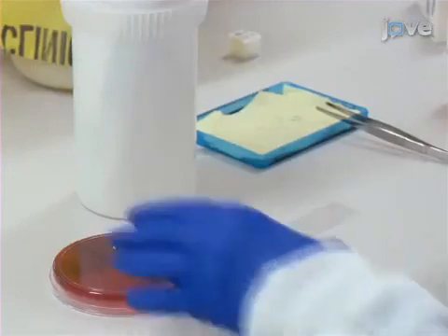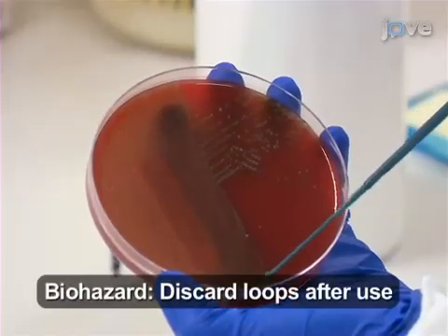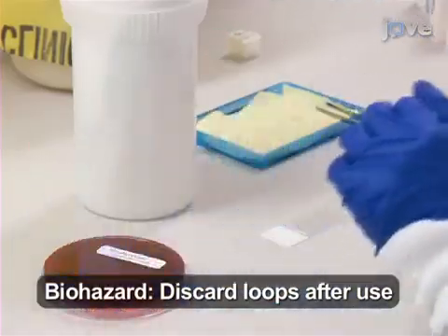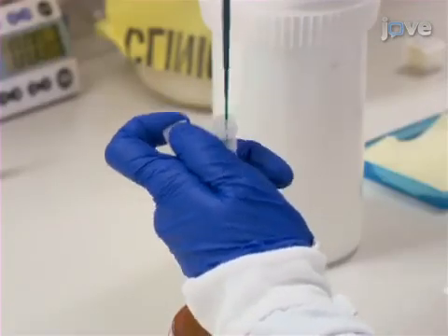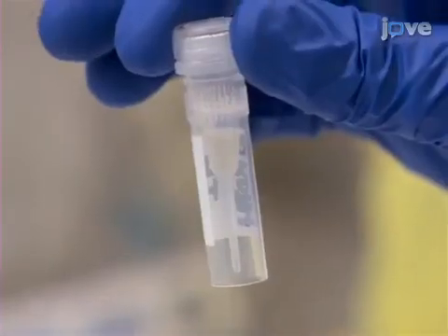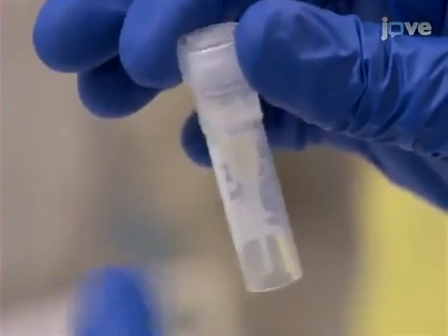Begin by using a sterile, disposable 1 µL loop to obtain a small sweep of a fresh, overnight pure culture of pneumococci, grown on a solid, non-selective horse blood agar plate. Inoculate the pneumococci in 100 µL of heart infusion broth — the suspension should appear to be just visibly turbid — and gently agitate the tube to emulsify the cell solution.